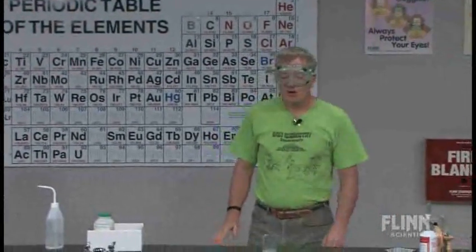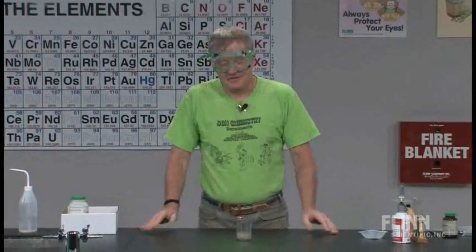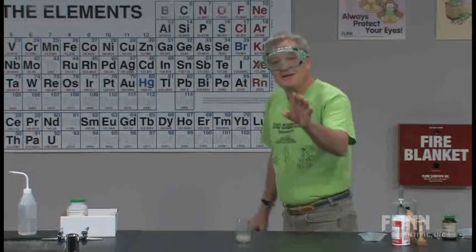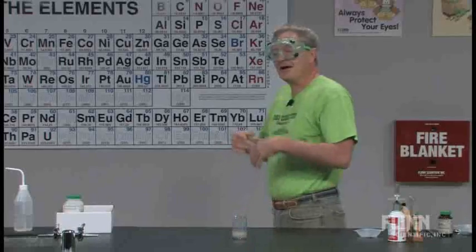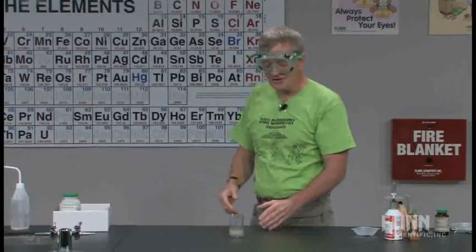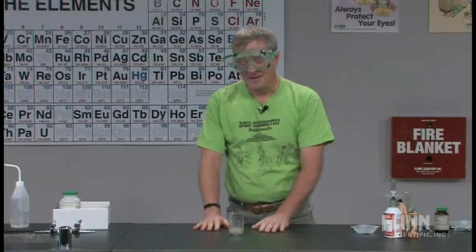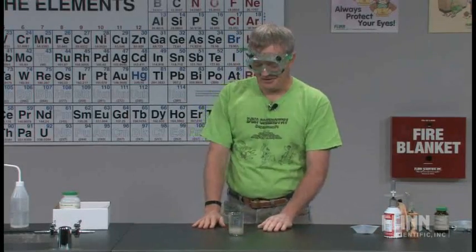Now, every good demonstration, and this is a great one because it shows wonderful periodicity. We've looked at magnesium and how it reacts with silicon and with carbon dioxide and with water and those kinds of things. And we've got the methane and the silane thing. But a good story always goes well with this.